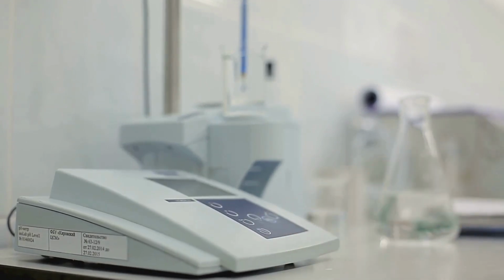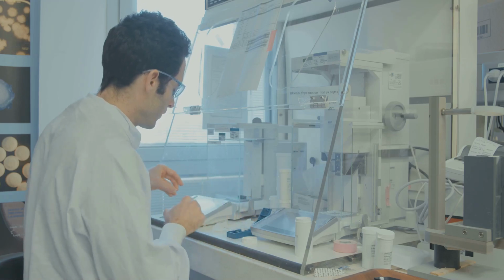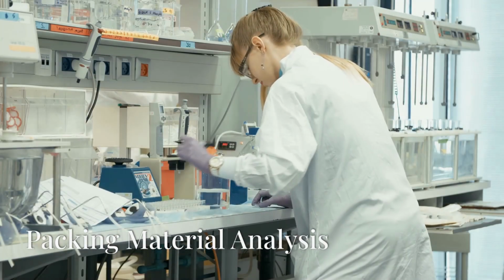Frequency. Routine calibration. Perform regular calibration as part of a maintenance schedule. Verification. Conduct additional calibrations as needed based on instrument performance and usage.